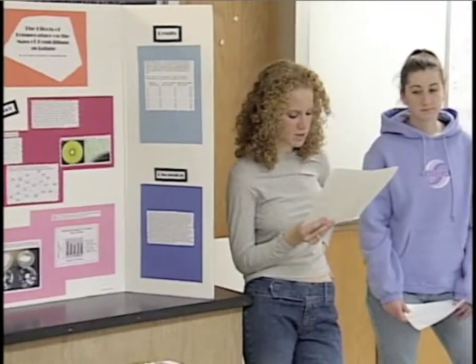To improve our inquiry, we would use a larger sample of Penicillium notatum and repeat the experiment using more Petri dishes so we would have more data to work with. And we would probably use a variety of temperatures too, not just 2 temperatures, to get an idea of which temperatures best propagate.